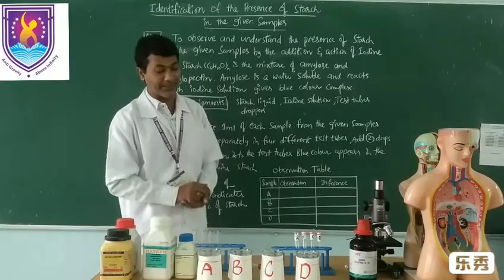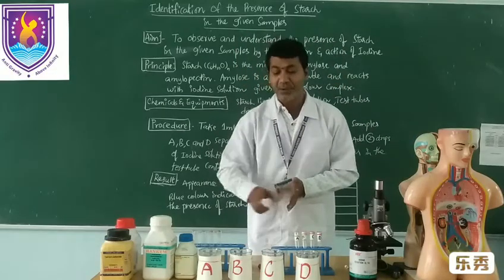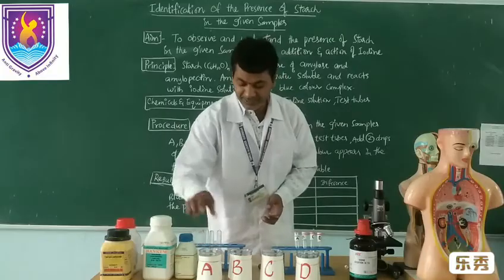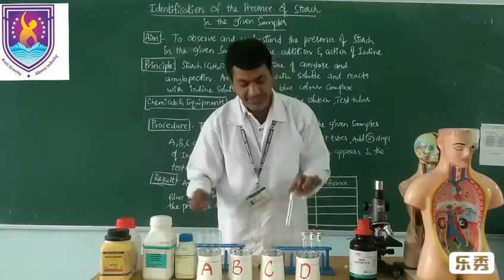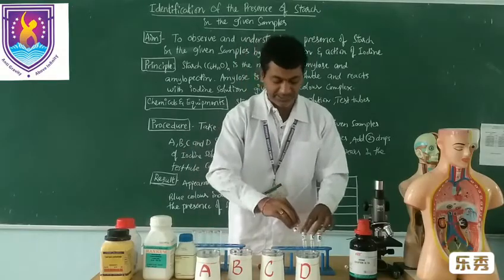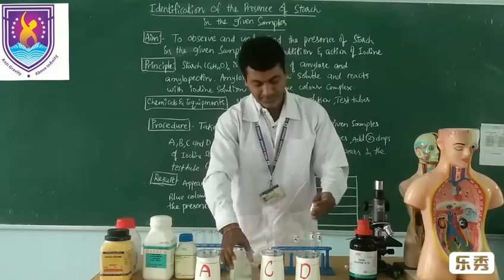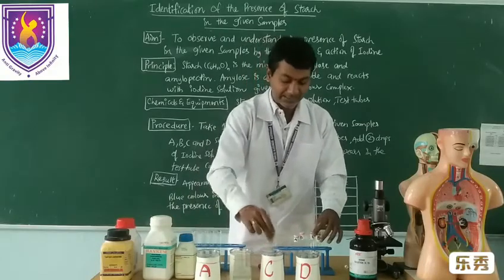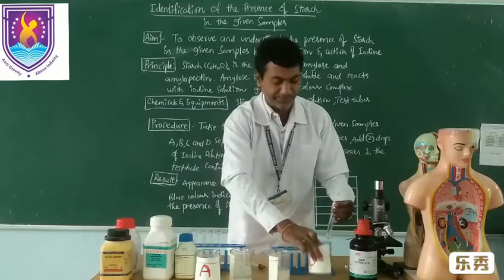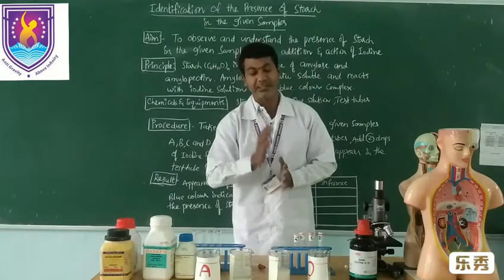So let us go through this activity in a simple manner. My students, to start — just observe: samples A, B, C, D are given. All are white-coloured solutions only; we do not know in which one starch is present. Then take every solution into its respective test tube. I mark test tube A and take a little quantity of sample A. Then B, and D. It is important to label correctly. Then sample B, and I am adding sample C into test tube C also. Then finally D. So I have taken these four samples from the four given samples.